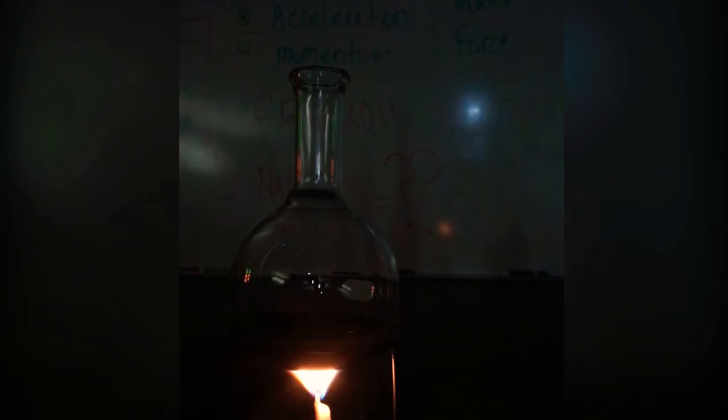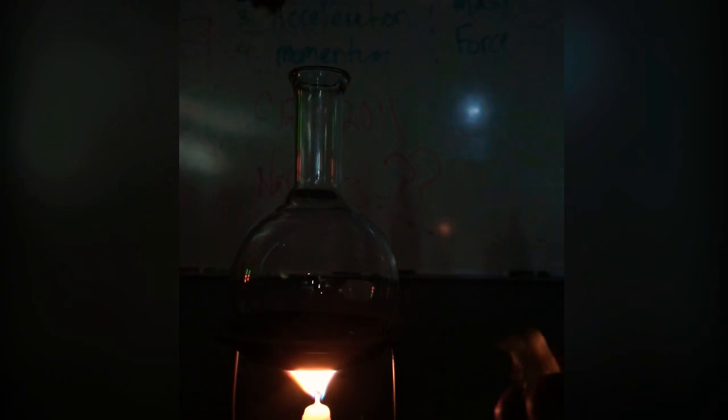Now, the real question, though, is our friend, the gummy bears. Okay, and we talked earlier about these guys. What do you guys think's going to happen? What do you think will happen when I just have these guys drop down into a nice bath of 300-degree potassium chlorate? Well, there's lots of videos on the internet, and the way I describe it, it's like you get to see a mini solar eclipse.